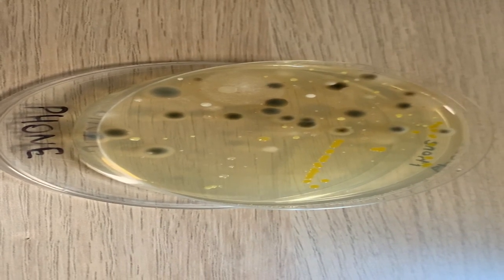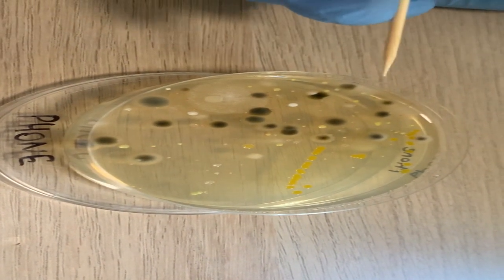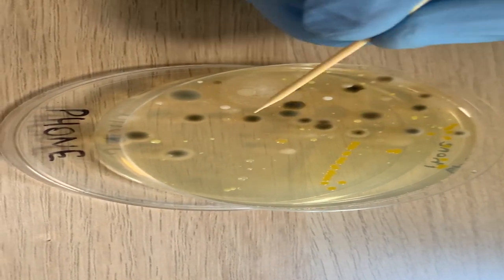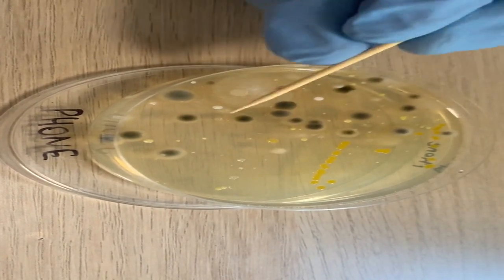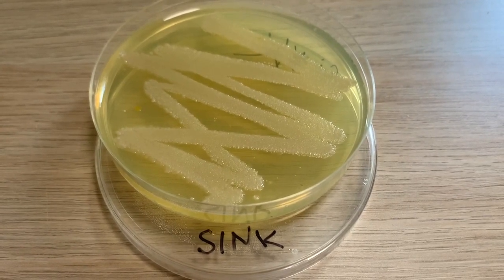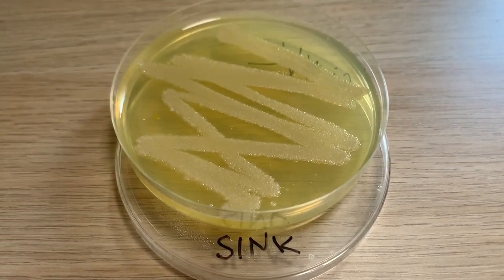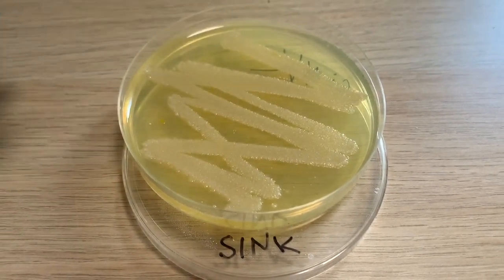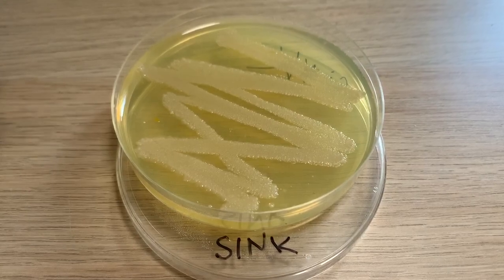Our next sampling place was the screen of the phone. Here we can see round orange colonies, which probably belong to Staphylococcus. Another small roundish colony are probably Micrococcus. And here you can see several fungal species. Now we are going to take a look at our kitchen samples, starting from the sink. Surprisingly, in the sink we didn't observe as great a variety of species as we saw in previous cases. However, the species which you see here is the most numerous — we don't know the precise species, but we think that it's Escherichia coli.